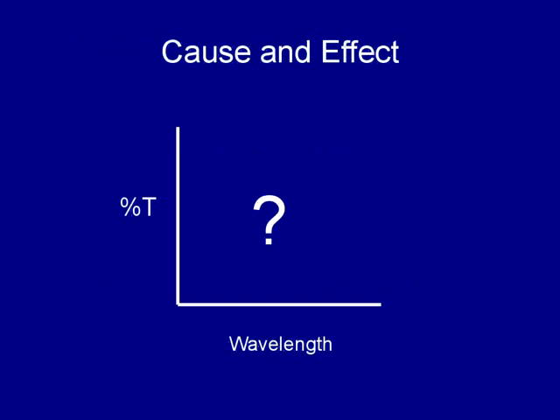You should test every wavelength for every one of the samples. Do you think it would be interesting to study the variation of wavelength with transmittance? What can a graph of percentage of transmittance versus wavelength tell you?